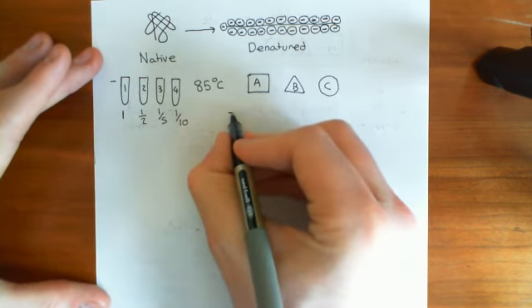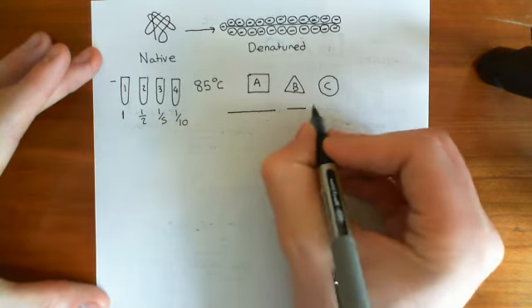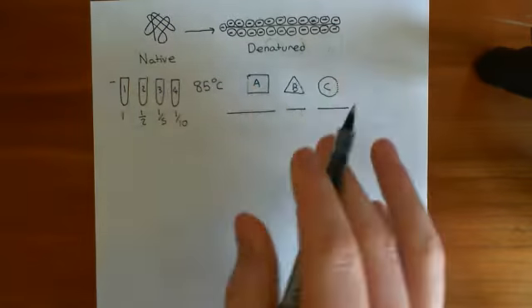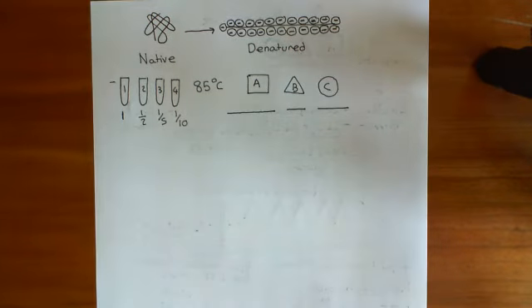Now let's say protein A is the longest. So here it is. It's a nice long polypeptide. Let's say protein B is a very short one, and protein C can be somewhere in the middle. And of course they're completely now surrounded by SDS molecules. So all of the proteins in our samples are now linear polypeptides, and these polypeptides are surrounded by dodecyl sulfate anions. So what we're now going to do is load it into wells. We're then going to run the gel electrophoresis and separate out these proteins by size.